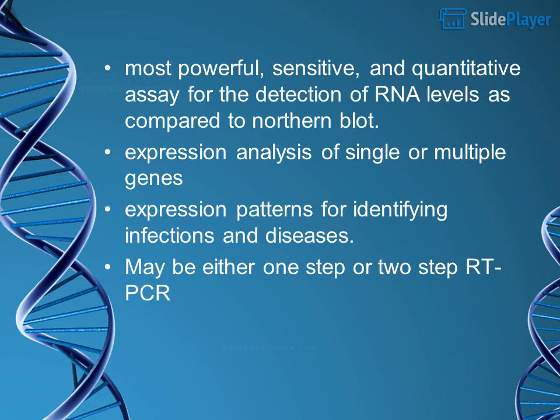Most powerful, sensitive, and quantitative assay for the detection of RNA levels as compared to northern blot. Expression analysis of single or multiple genes. Expression patterns for identifying infections and diseases. May be either 1-step or 2-step RT-PCR.